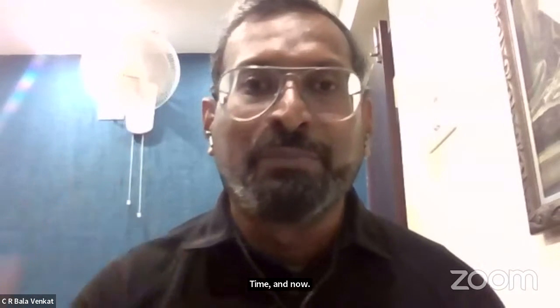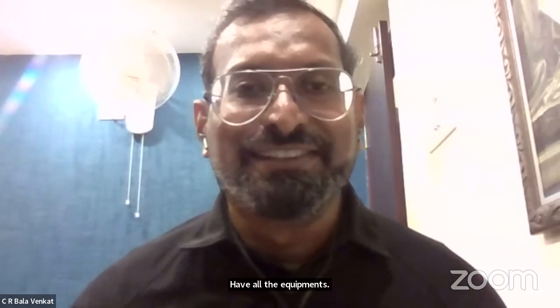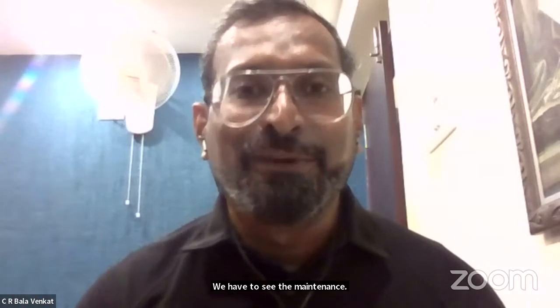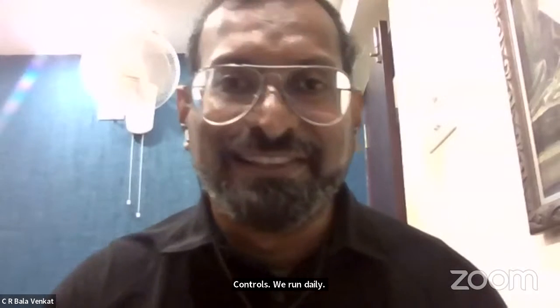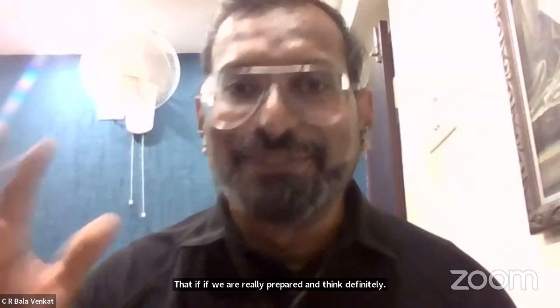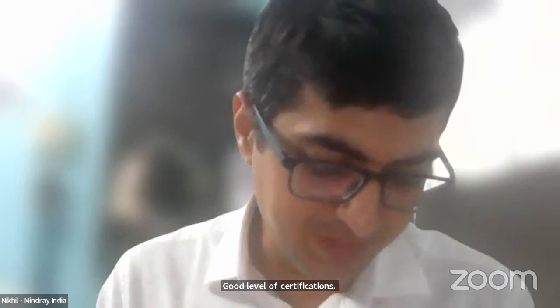to do calibration, we have to buy calibrators, we have to have all the equipment in place, we have to see the maintenance controls to be run daily, and we have to document it. So if we are really prepared, definitely all are really good levels of certifications from a certification body. Dr. Jay sir, one more question for you.